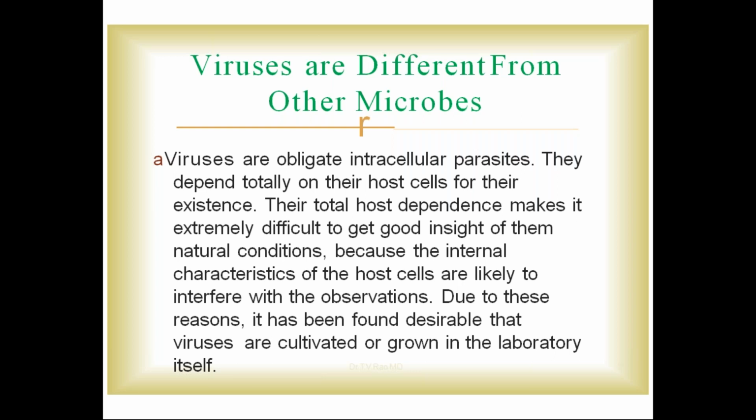Their total host dependence makes it extremely difficult to get a good insight into them in natural conditions, because the internal characteristics of the host cells are likely to interfere with the observations. Due to these reasons, it is desirable that the viruses are cultivated in the laboratory itself. We have to grow them using embryonated eggs, sometimes tissue cultures, or inject them into various animals so that the viruses will multiply in these living cells.